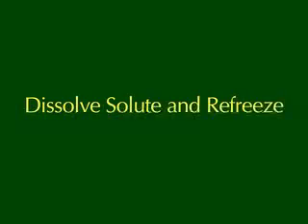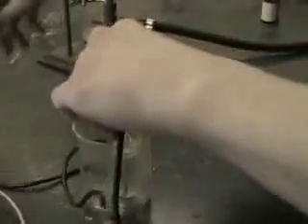In our second trial, we melt the solvent and add a solute, which should lower the freezing point. In this experiment, we use an organic solute, which will not dissociate. Thus, the Van't Hoff factor will be 1, and our calculations will be simpler.